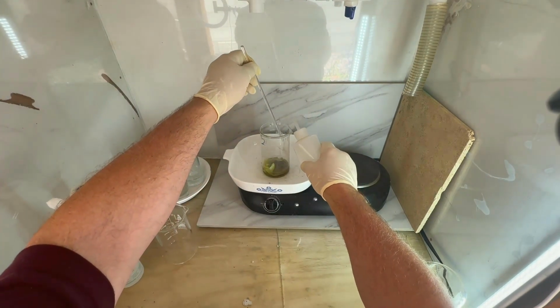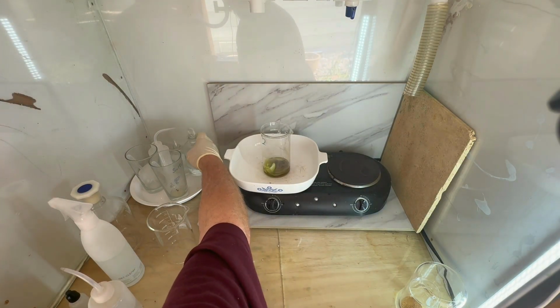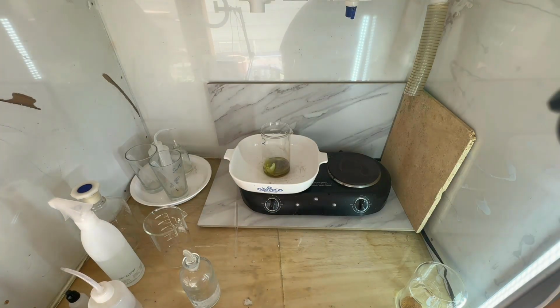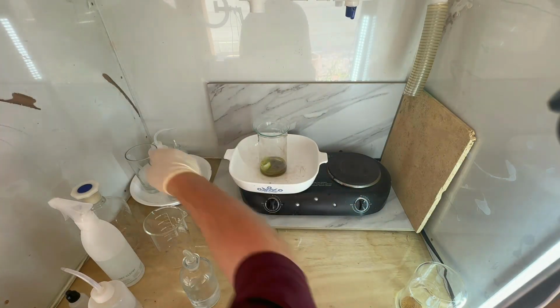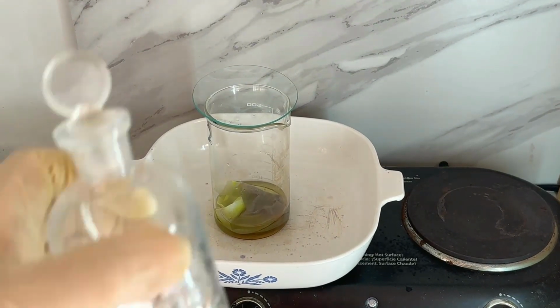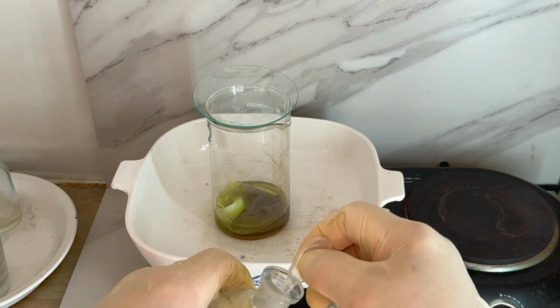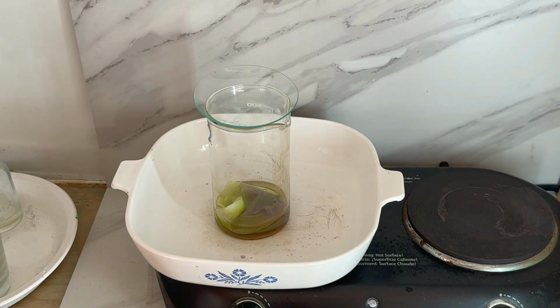The aqua regia will dissolve the filter, and we'll clear that out later when we filter this solution once it's done dissolving the gold. In the meantime, we're going to put ourselves on the heat, put the cover on, and we're going to add some nitric acid. I'm not expecting a whole ton again here, but we're going to go ahead and put about 4 milliliters in to start.